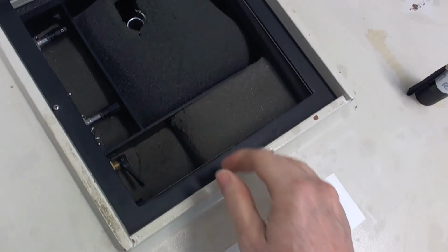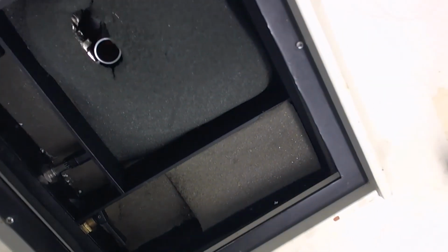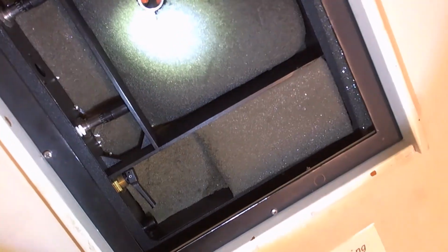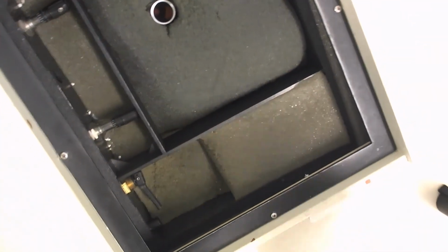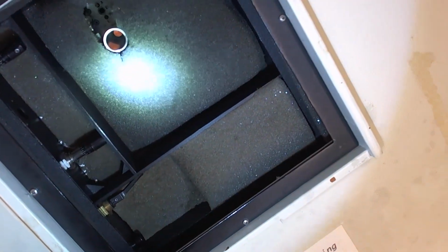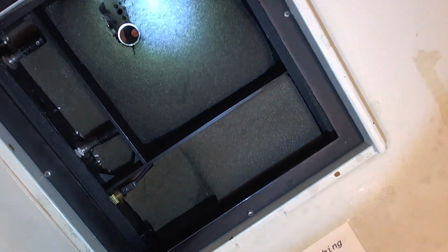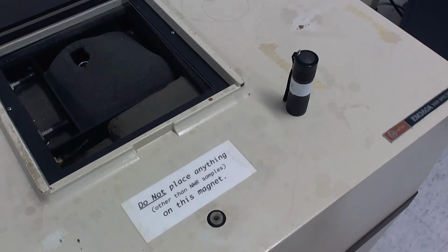turn it at 90 degrees, and the sample goes into the tube. It can be hard to see. There is a flashlight here. There we can see the red cap of the sample. When the lever has been pushed, it's not spinning. So we put the lever back into its original position, and we want to check to see if the sample is spinning. It's easier to see this in person. There are some marks on the spinner that are like spokes, and if it's spinning, you cannot see those spokes. If they are not spinning, you can.